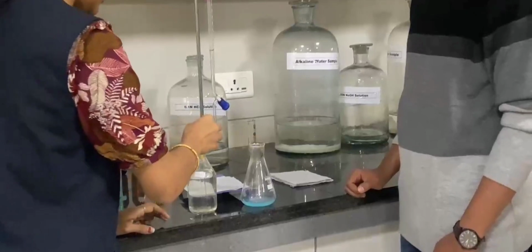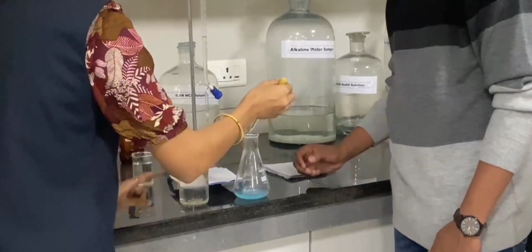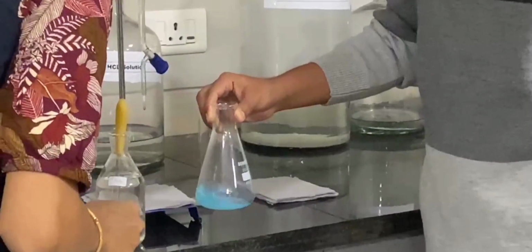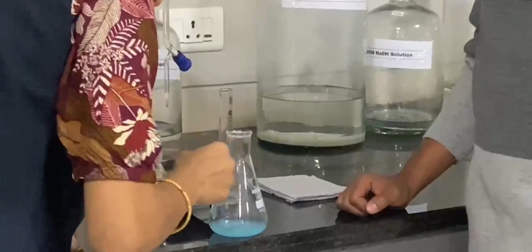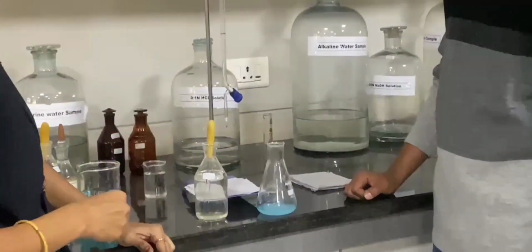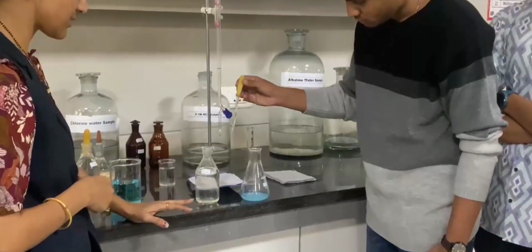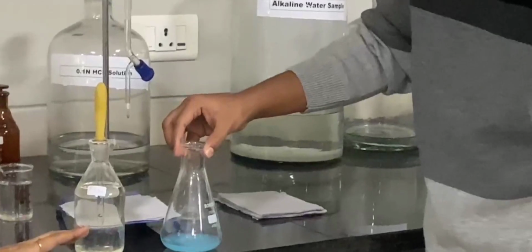Now again we have to add one or two drops of sodium carbonate till the turbidity appears. You can see the turbidity in the conical flask. Now shake. Yes, now we can see the turbidity in the conical flask. We can add one or two more drops of sodium carbonate. Now it is enough. You can see the turbidity in the conical flask.